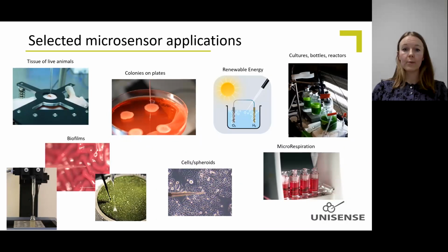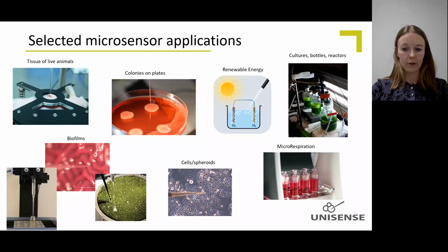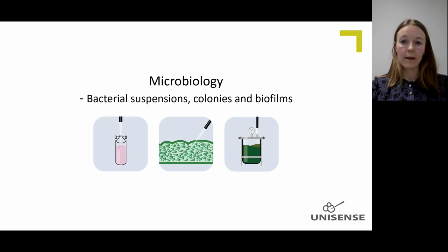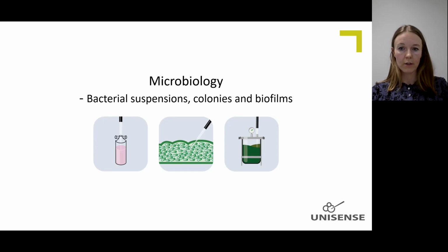Now we will explore some different examples of studies using microsensors within microbiology, biomedicine, and renewable energy research. So the first examples are within microbiology, and I will show you how you can measure both in bacterial cultures, in colonies, and in biofilms with the microsensors.